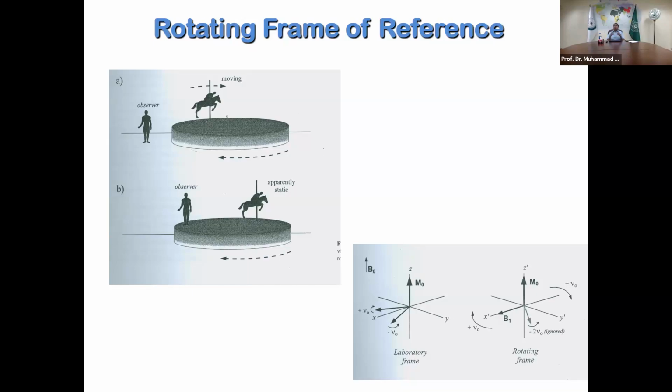And remember that in an NMR experiment, you need to play with them. NMR spectroscopy is playing with pulses and playing with the magnets, these magnetic vectors. In many experiments, which you will see after this lecture, you would be able to appreciate the fact that the exact location of these vectors on the XY plane is something so desirable for you to understand, because only then would you be able to give the second pulse.